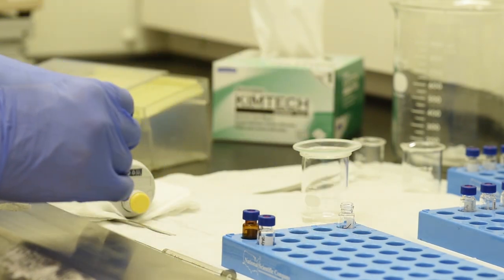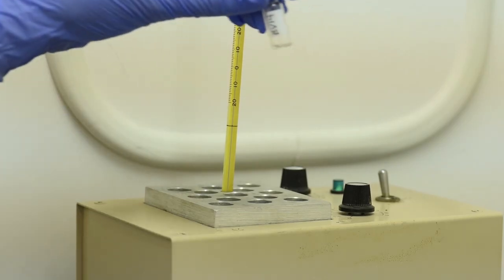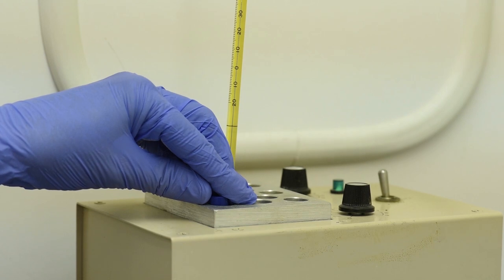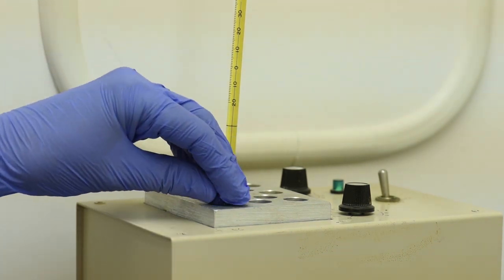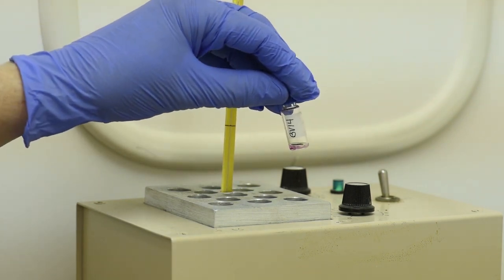Frequently, the first step is a chat with one of our scientists, who will review the scope of your questions and advise whether our team will be able to help. We will also determine the size and number of samples needed.